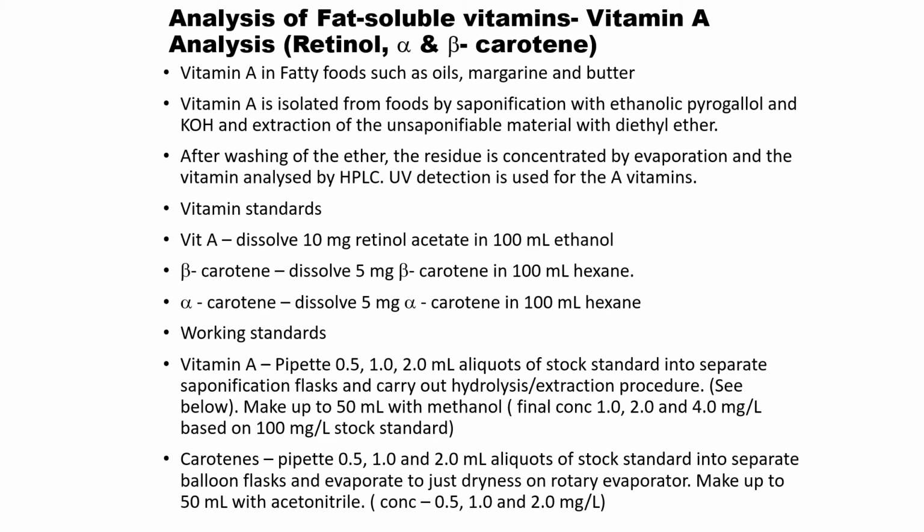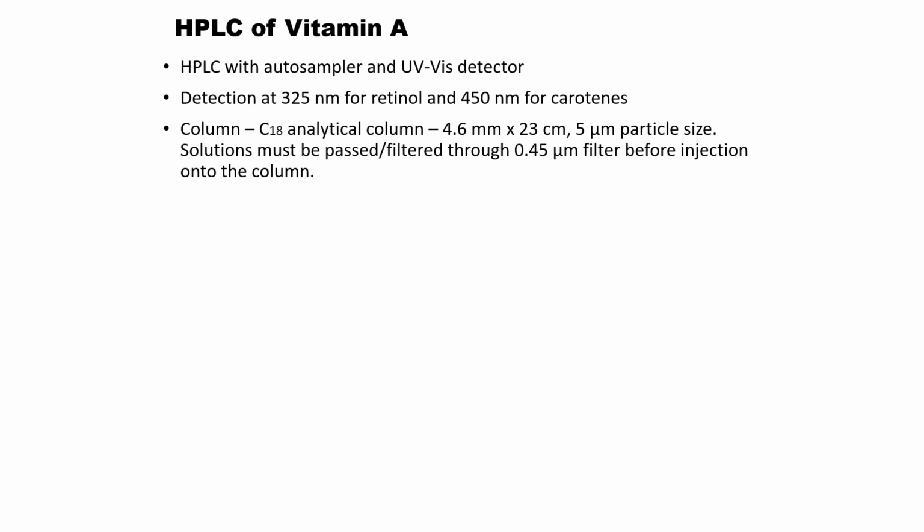So for vitamin A, how much it should dissolve, these working standards, everything is clearly mentioned here under this method. And these are the conditions for the HPLC. So for retinol, the wavelength will be 325, for carotene 450, and a C18 column.